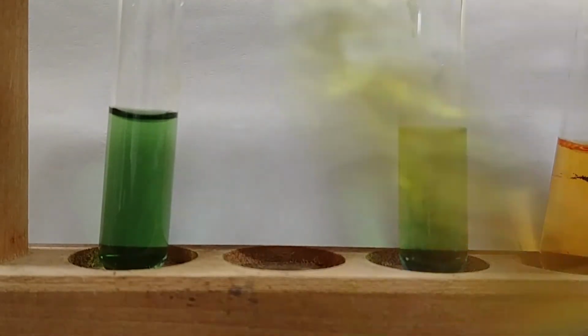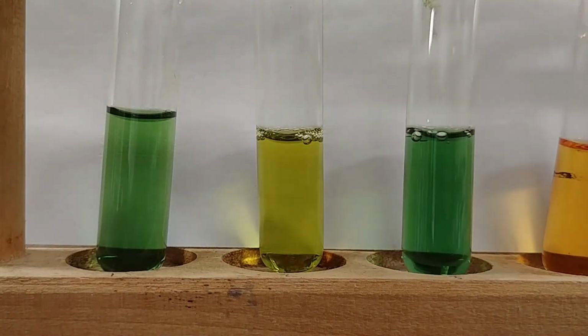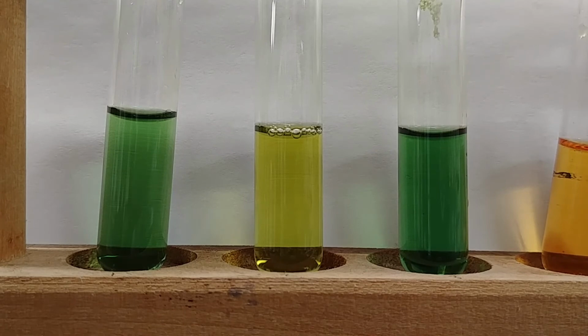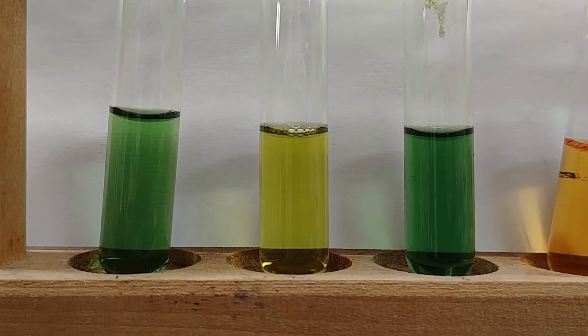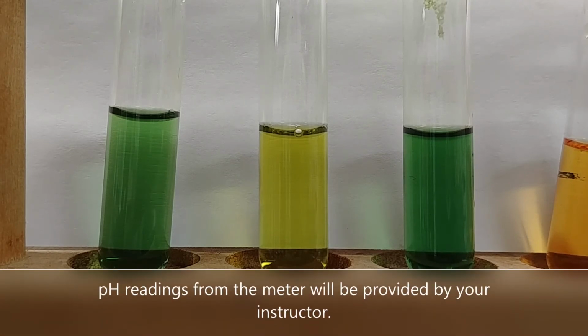So we'll mix it up again. And again, we do see a little bit of a change, but that change isn't nearly as drastic as what we saw with our water solution. So this kind of shows us the effect of buffers on our systems. We may not be able to maintain the exact same pH, but we do maintain a roughly similar pH. Notice how everything still manages to be some kind of hue of green. And again, we'll actually test the pH using the pH meters and have those available for you to see later.